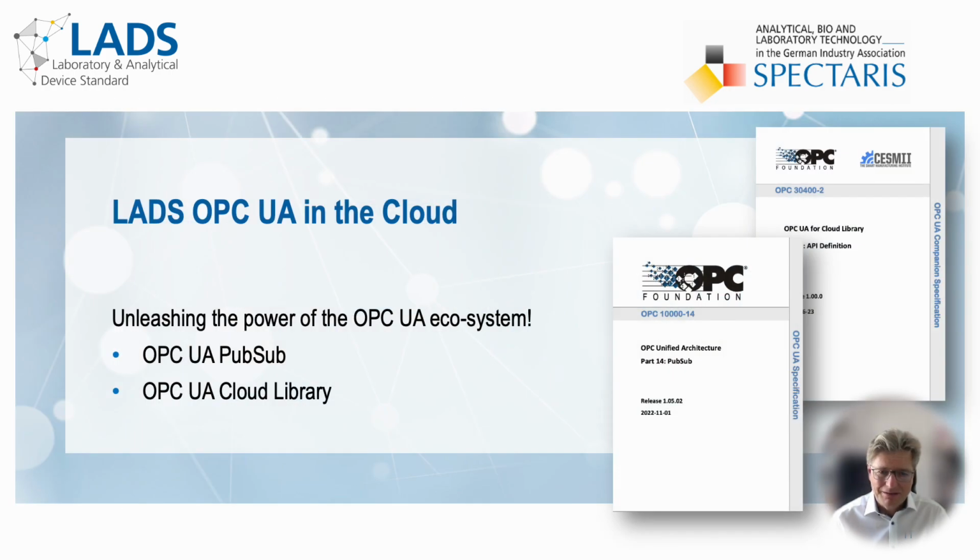By the way, did I mention that cloud connectivity is an important use case in the laboratory and analytical domain as well? And as you all know, the OPC UA interoperability standard provides a solution for this requirement.